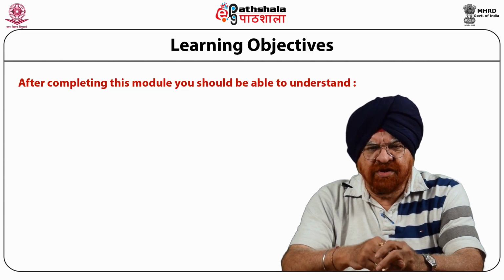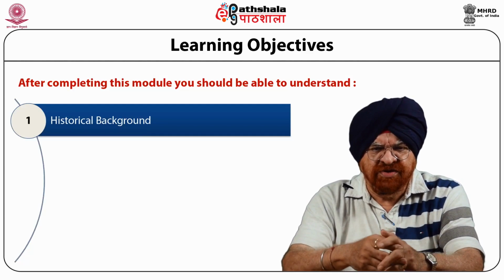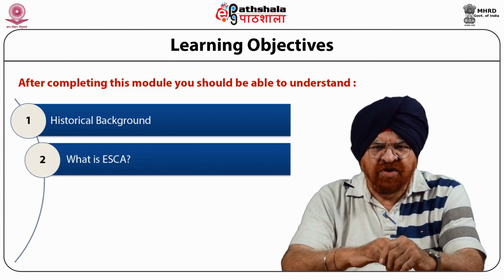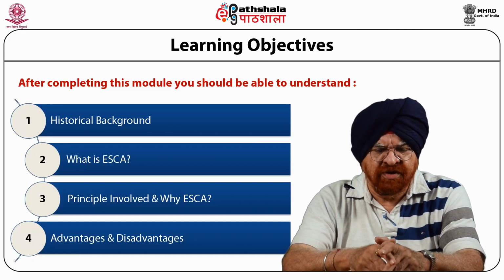After completing this module, you would be able to understand very properly the historical background of this. A question like what is ESCA? What are the principles involved in this? And why do we study ESCA? What are the advantages and disadvantages of this spectroscopic technique?